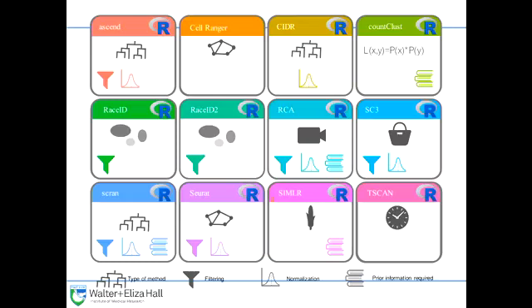These are some of the methods available out there at the moment. The key ones I'll point out are CellRanger. CellRanger is a piece of software produced by 10x Genomics, which is the producer of the major platform, currently the most popular platform for doing single-cell RNA-seq analysis. So the CellRanger software pipeline is a default that many people will run. It has a clustering approach, so that's present there.